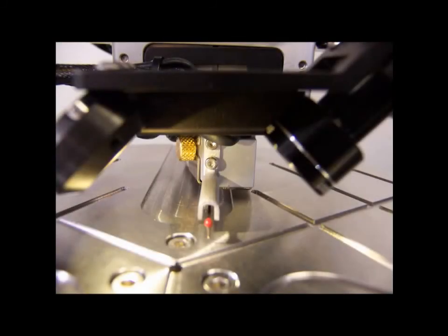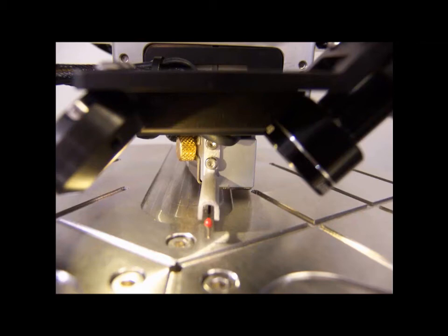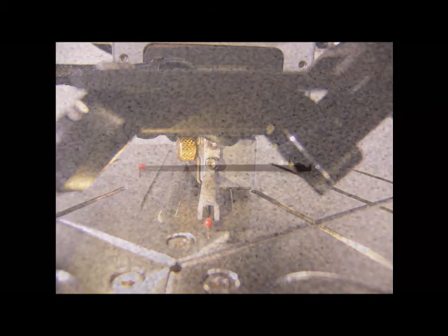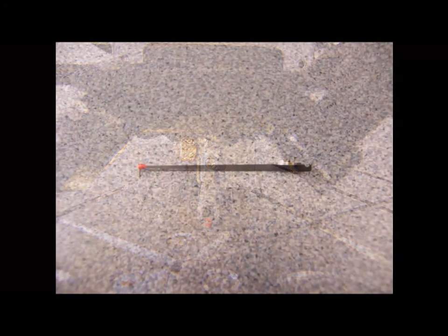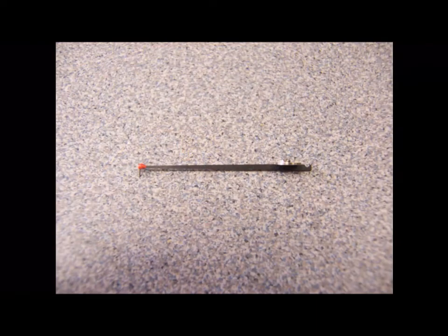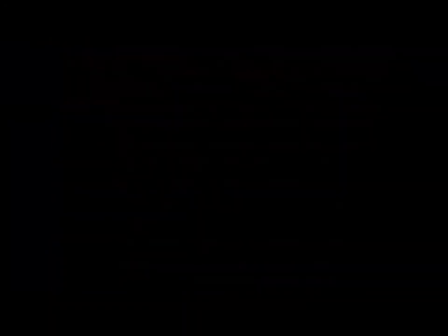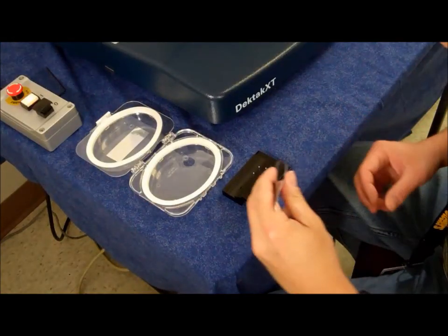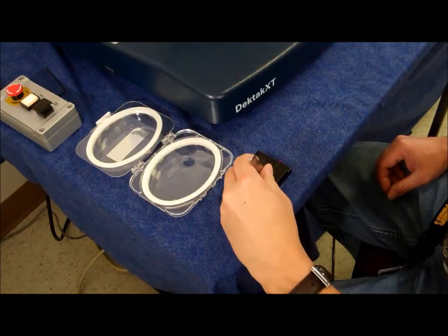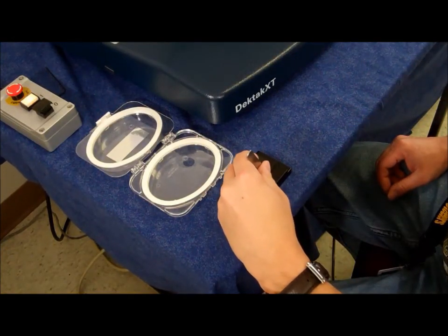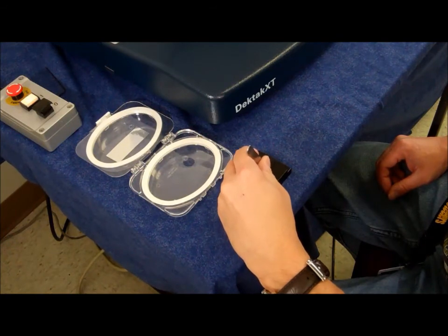The DECTAC XT sensor head magnetically holds the measurement stylus and contains the feedback mechanisms required to track stylus movement as it rides over the sample surface. There are a wide variety of stylus tip sizes available depending on the particular measurement application. Each stylus is shipped and stored in its own protective case.